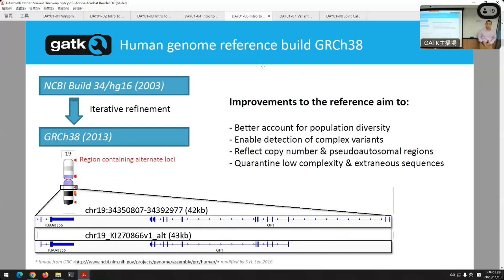So there's no one person that actually has the exact same bases as that reference. But they did the best they could. They took the most common alleles, most common bases from each person, just to get something that's close enough to the canonical human genome. But the actual bases aren't important. It's really what differences you have relative to the reference.